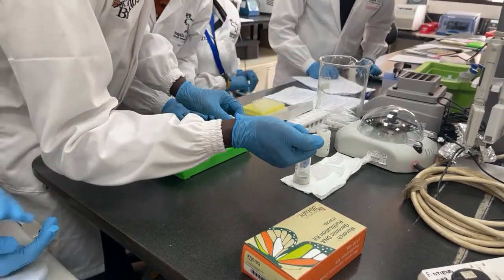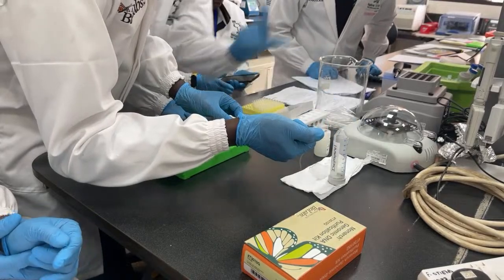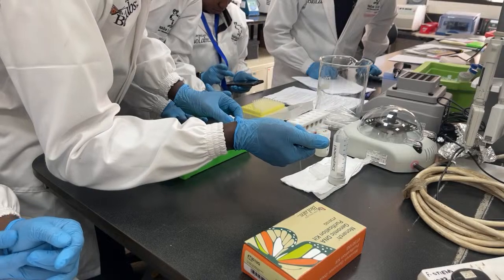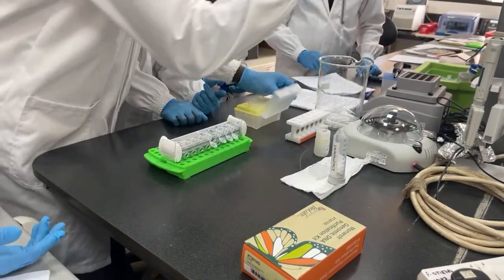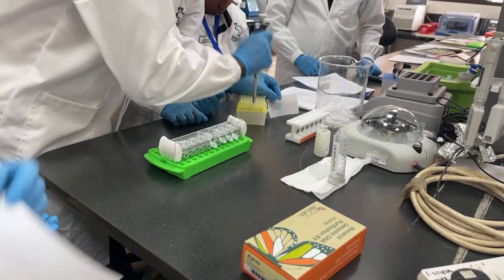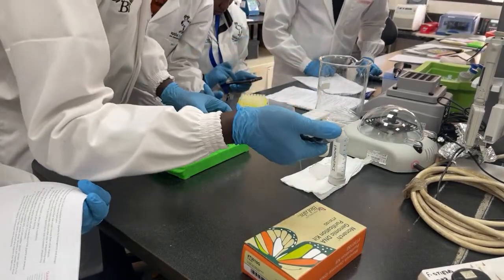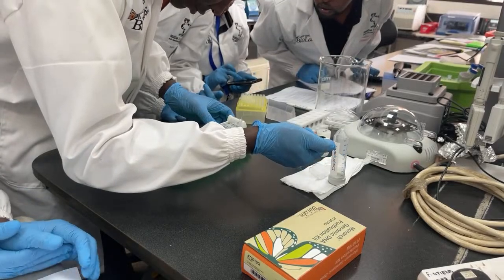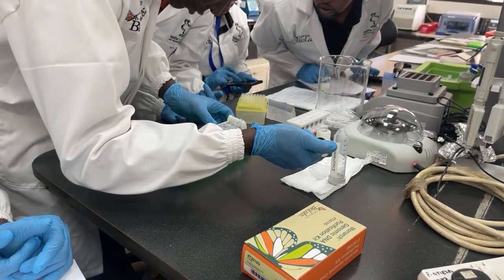Let me just see if there's any more minutes. 10 minutes. If it's step 41, how would I put in step 41? Not removed all the liquid. You still have this liquid, so you have to repeat.